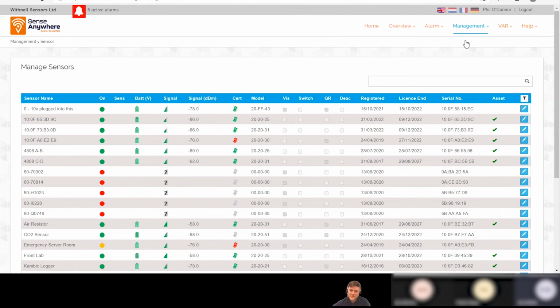We're all in the real world. We know this. We know the situation. Yeah, that's fine. Exactly. We've enough to be doing ourselves, calibrating customers' chambers and stuff. But we've quite a lot of equipment at the moment, and we've a big workshop, so we do them ourselves. It works well for us, but I understand that's not always possible. So that's fair play. Thanks for that. That's good for understanding anyway, because it's a sticky one. It's a tough question to answer sometimes.